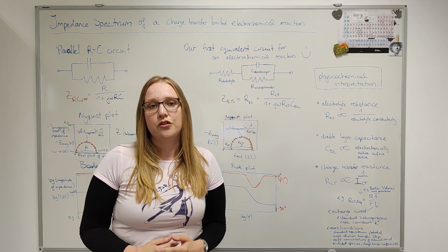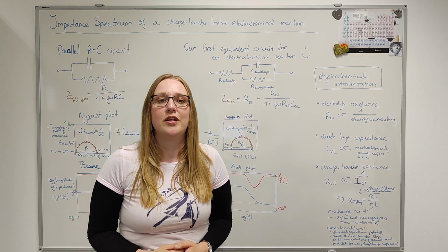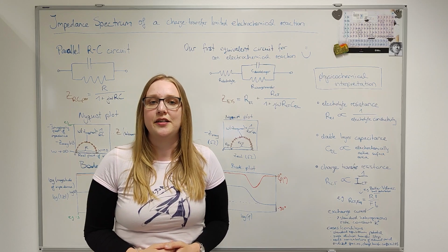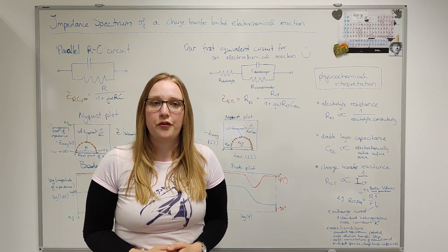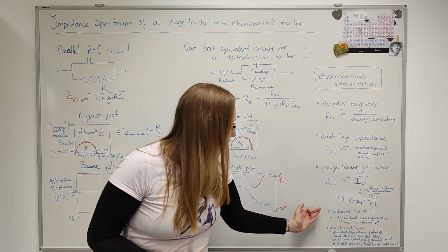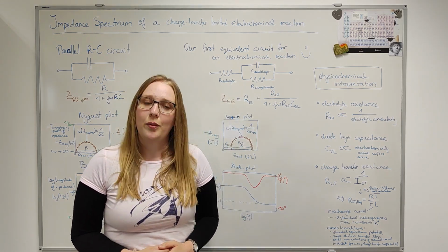While this is an exponential relation, for small perturbations as we apply during EIS, we may accurately linearize this equation and model it with a resistor. Under special conditions, we can calculate the exchange current density from this resistance, and we may use this to infer the standard heterogeneous rate constant. We must take special care that all the conditions and assumptions we made are fulfilled, because only then our equation is valid.